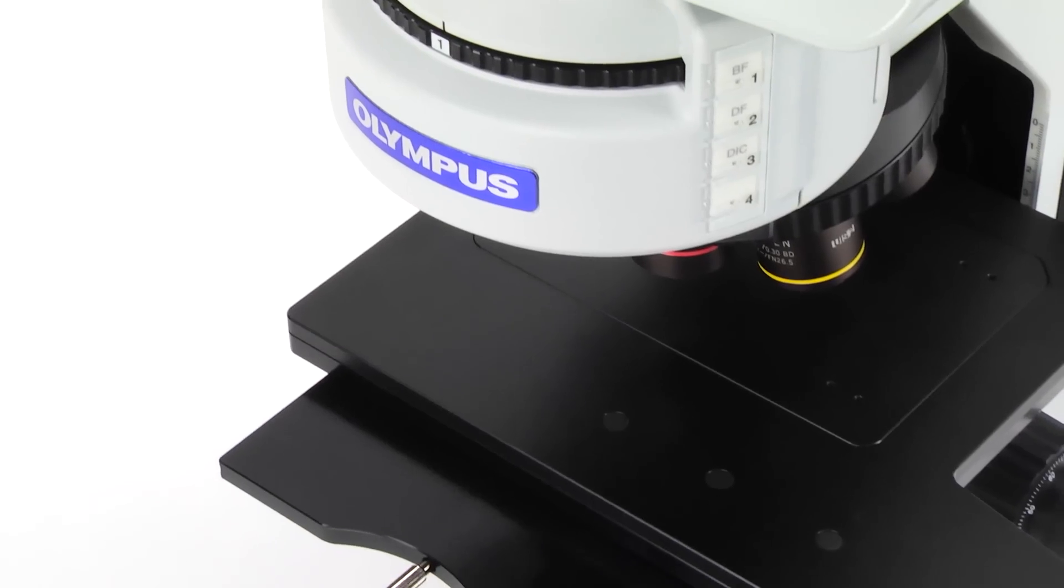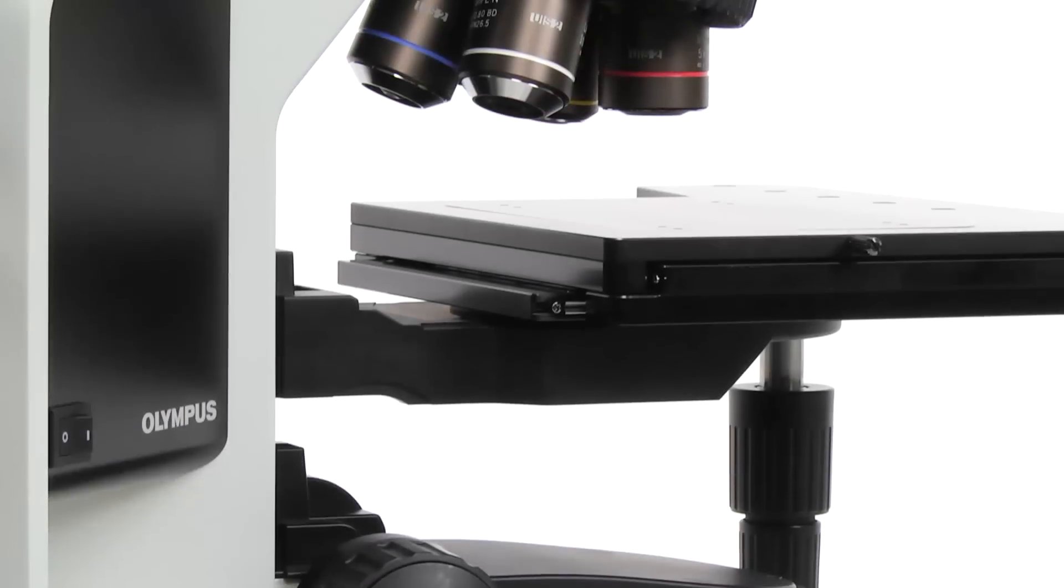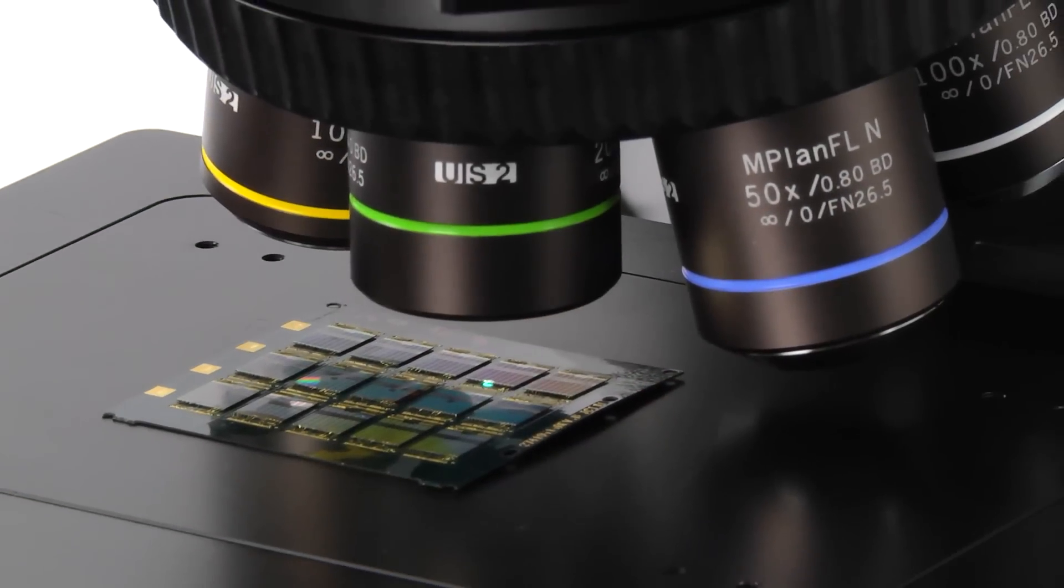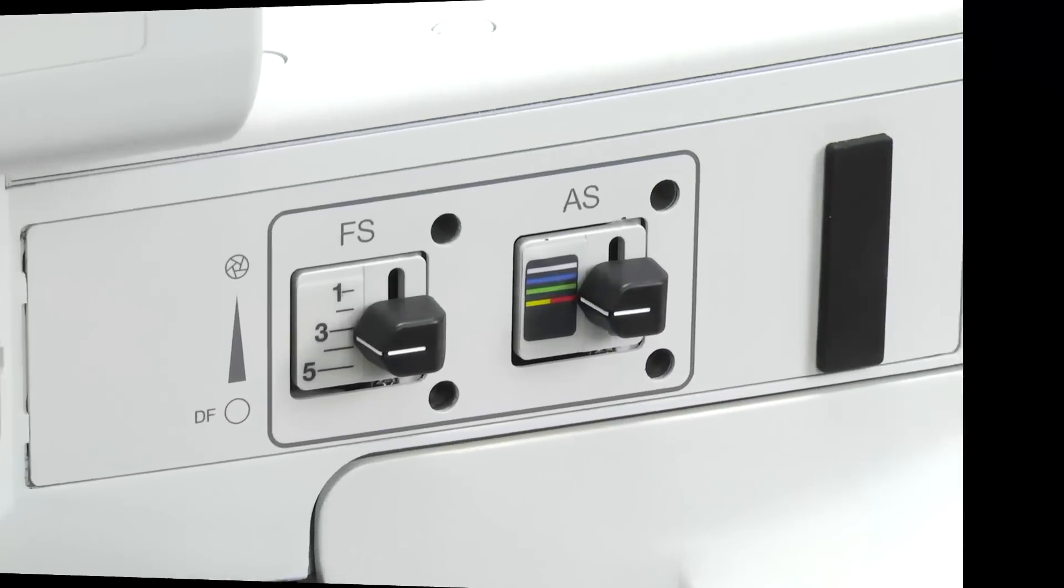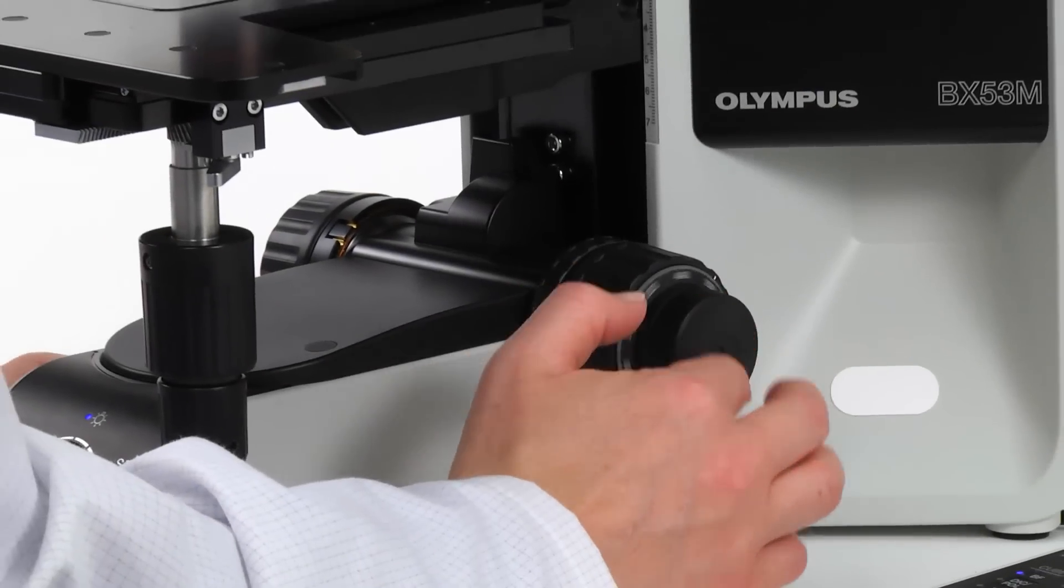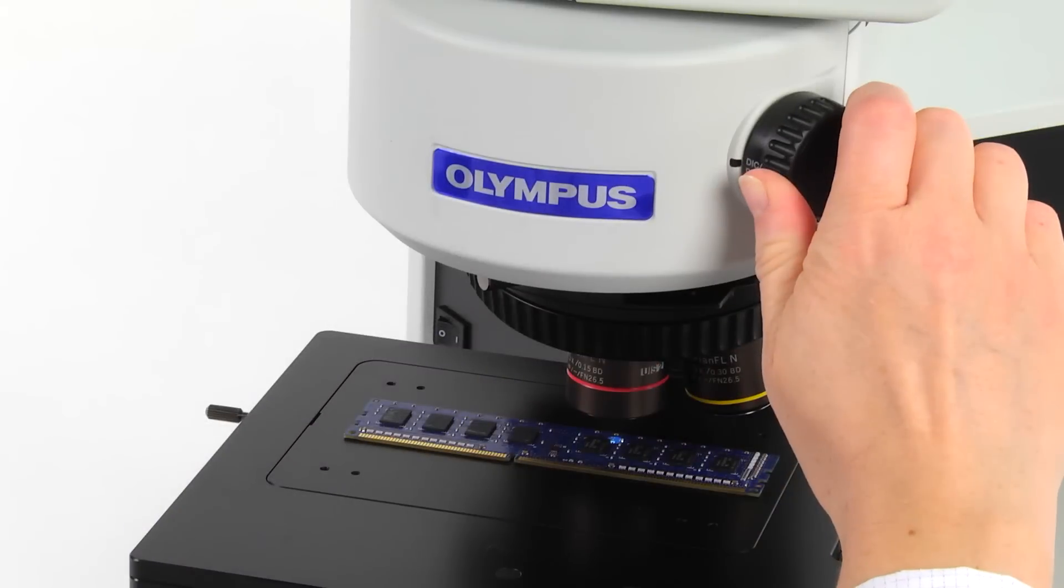The Olympus BX3M series of upright microscopes has been developed and designed for industry and materials science. Newly configured hardware guides the user to achieve optimal illumination and focus, making the microscope easy to operate.